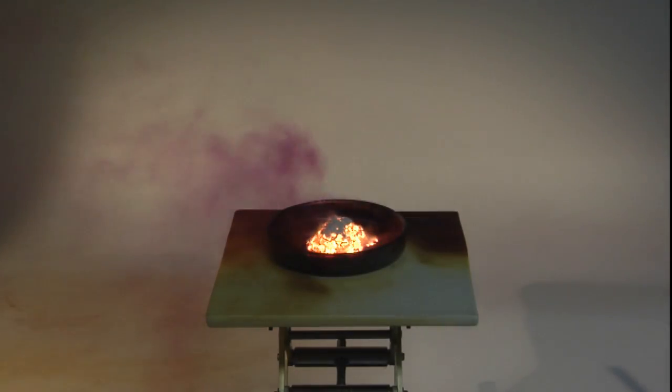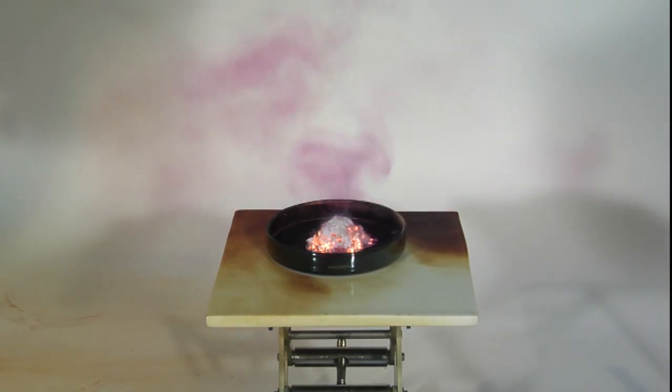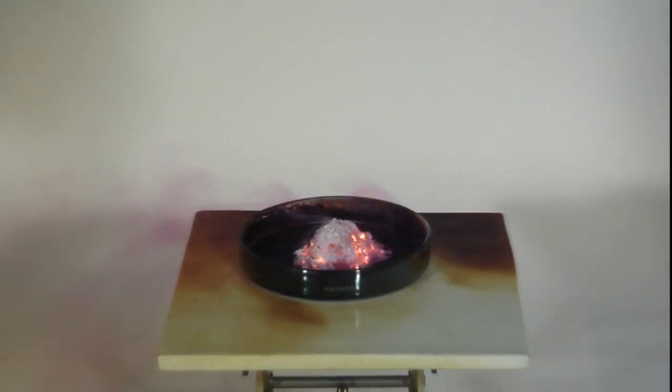The presence of iodide ions can be confirmed by adding silver nitrate solution. This causes a pale yellow precipitate of silver iodide to be formed.